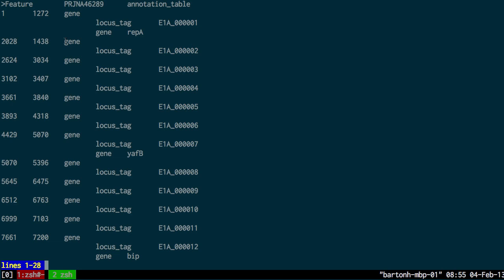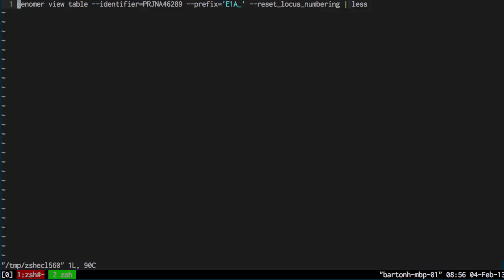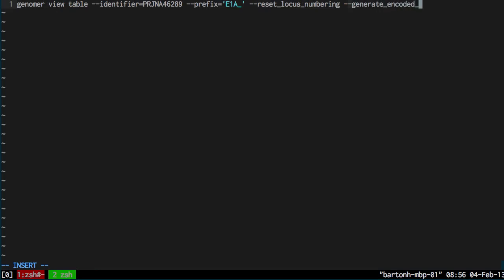But you can see that only the genes have been generated. None of the product or function information has been included for the encoded proteins. So I can add that finally as well. I'll do that here. That command is generate encoded features.